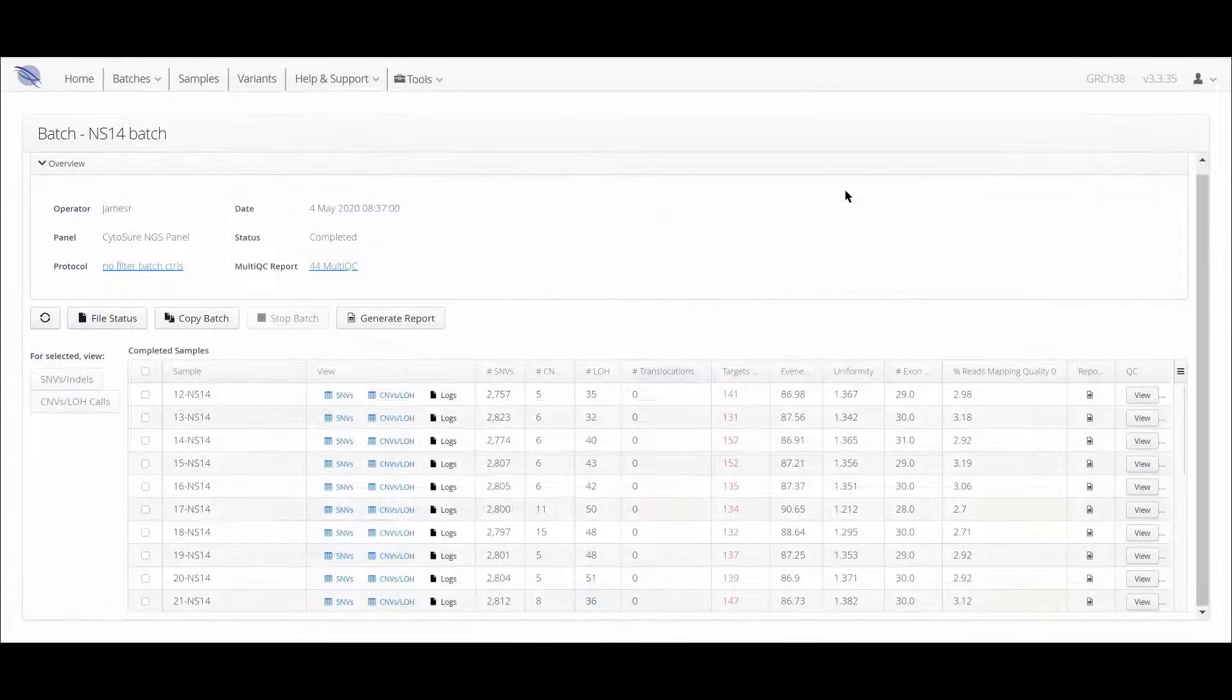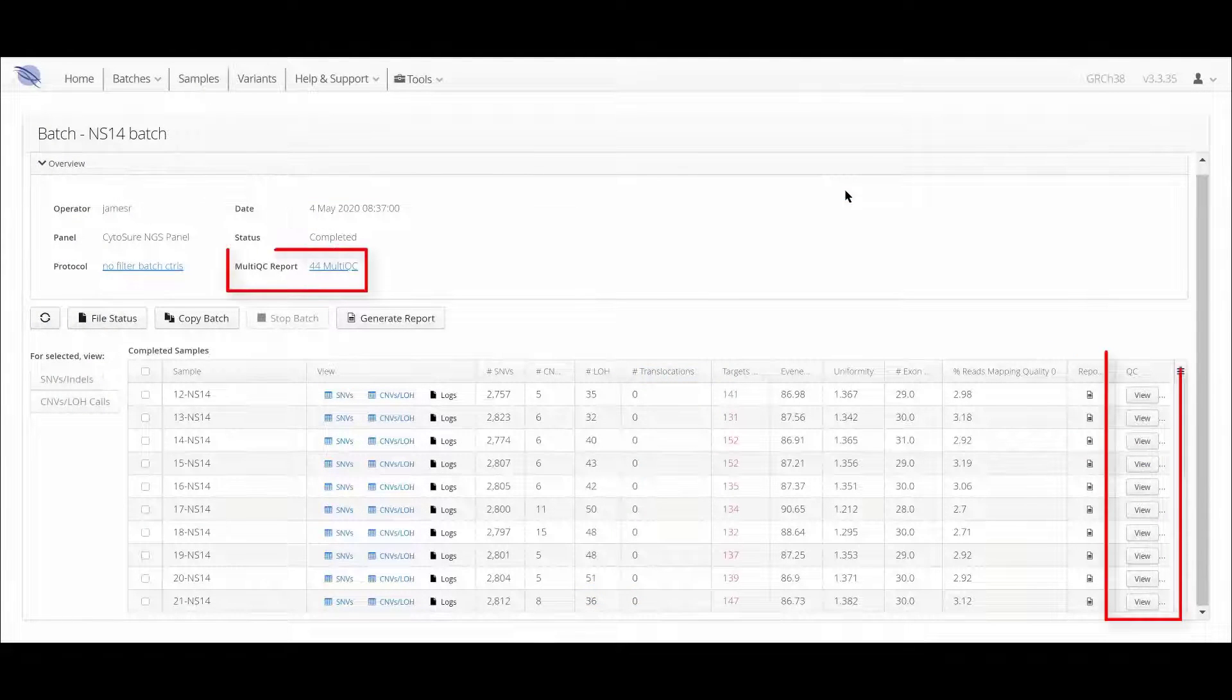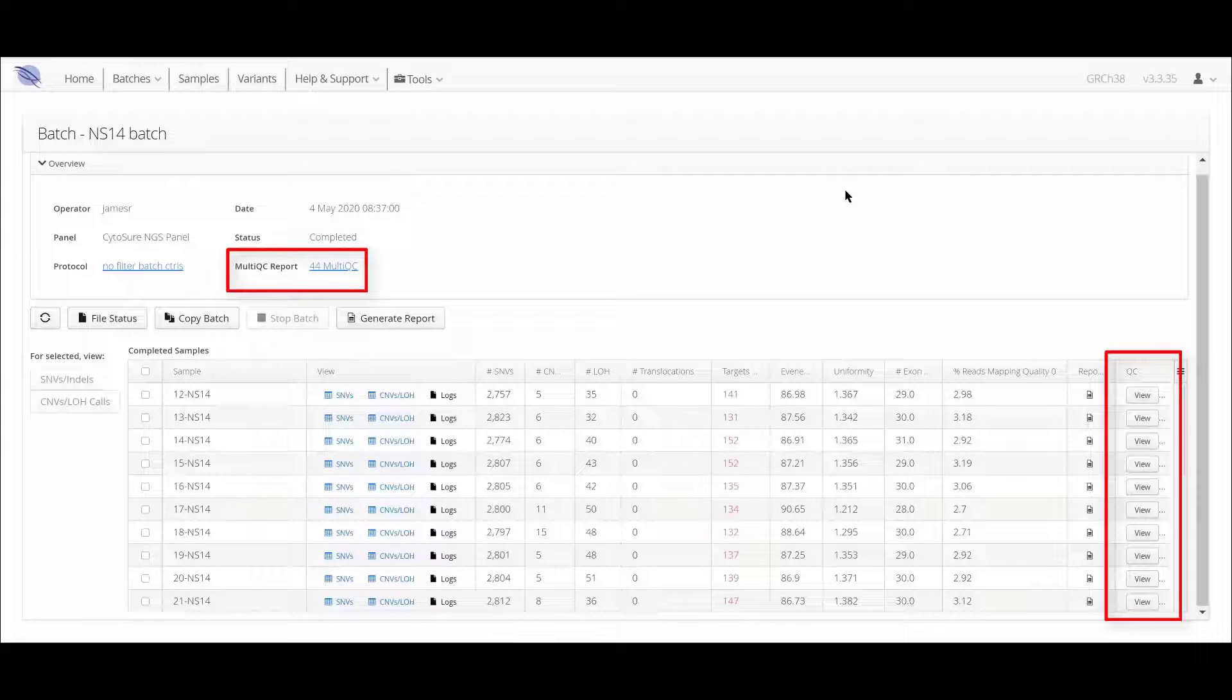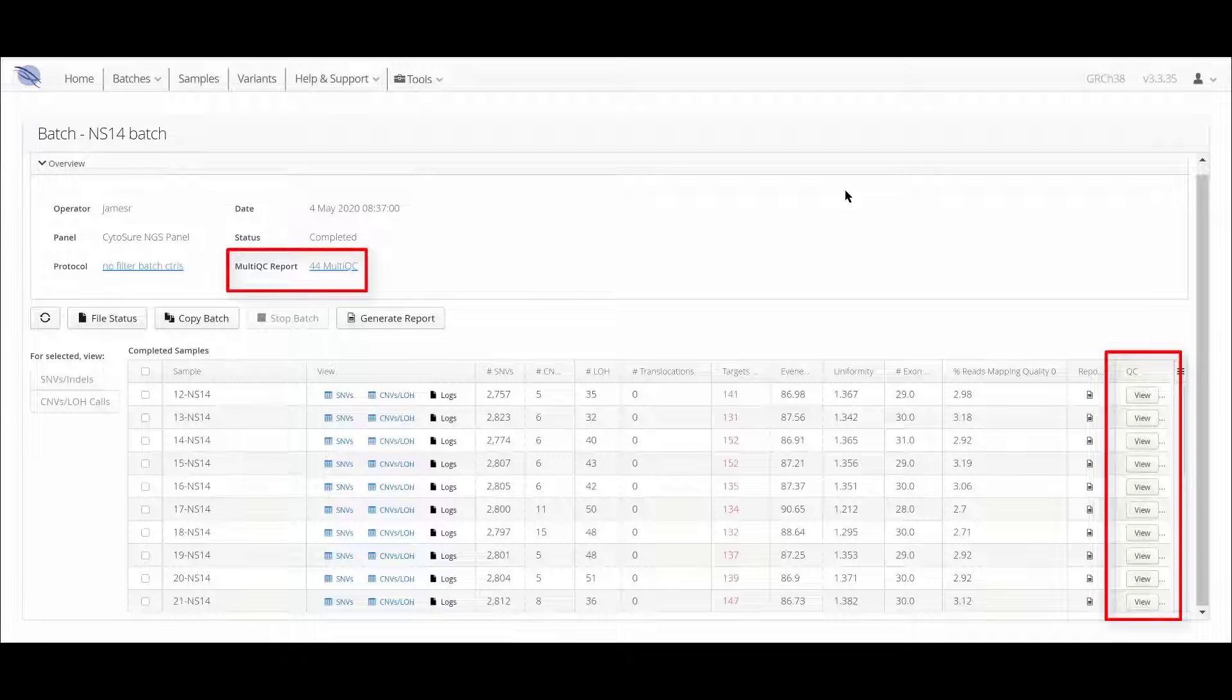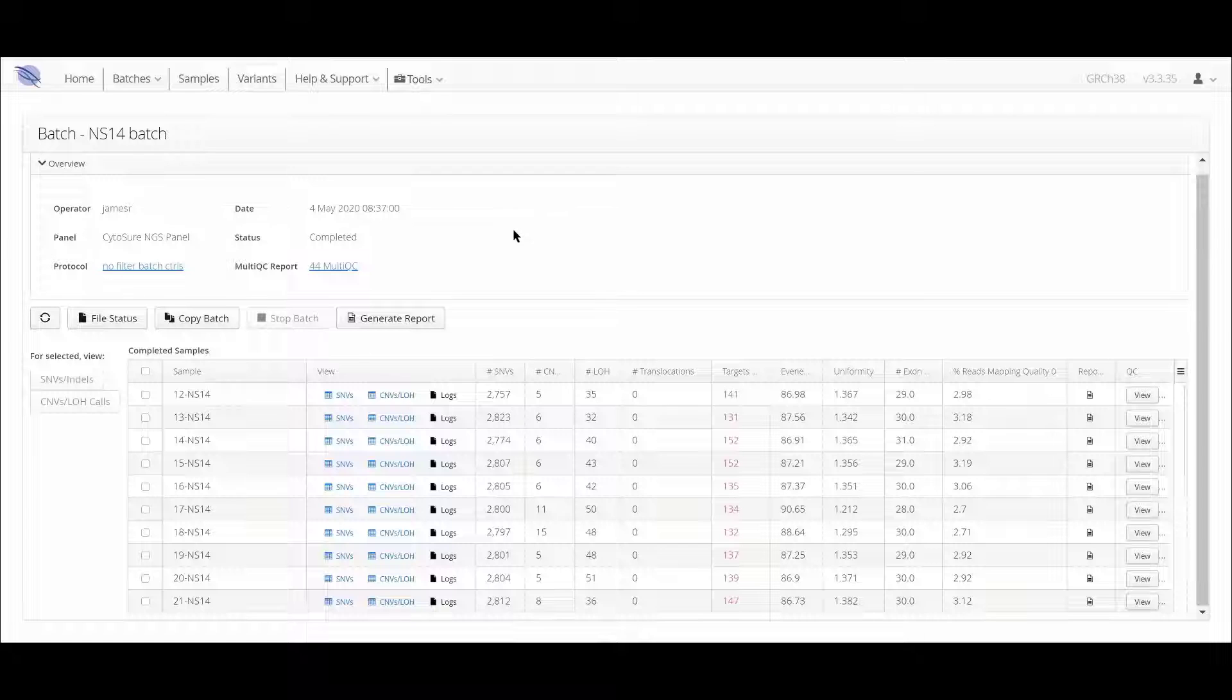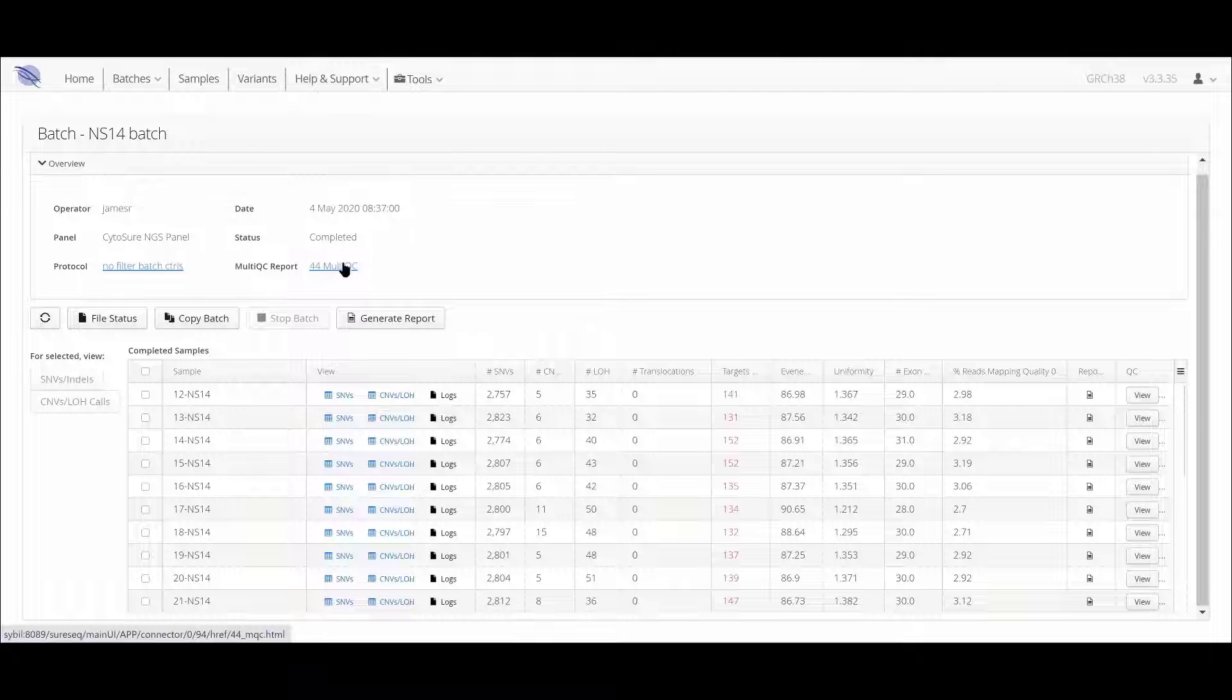If we return to the batch page, we can see two more options for viewing the quality metrics from the sequencing run. First, let's take a look at a MultiQC report.